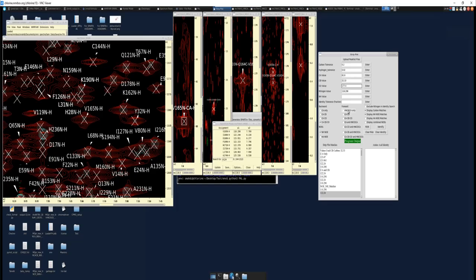CACO. Going forward, same thing, right? So you can search just the HN CACO. You can search the CACO. So what this does is run an HNCA first. Then it will look at your HNCO, right? And I think the rest is pretty self-explanatory. Don't want to go too into detail, but the README will describe this in more detail.